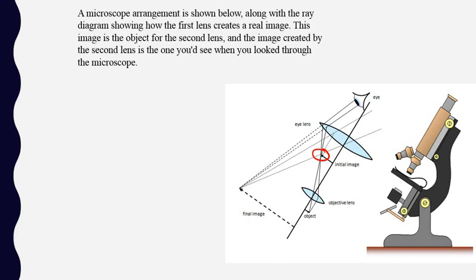All these rules of ray optics which we have studied are applied over here. First, the objective lens makes an initial image for the eyepiece lens. Then your eyepiece lens produces the final image, which is virtual, erect and behind the object, the final magnified one.